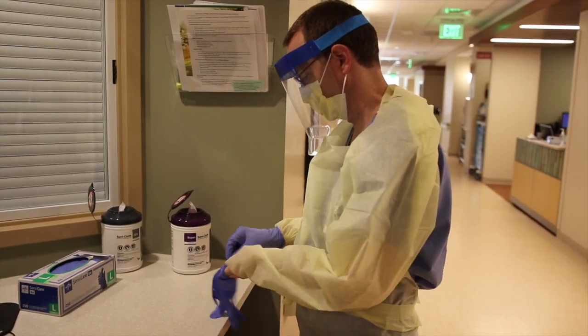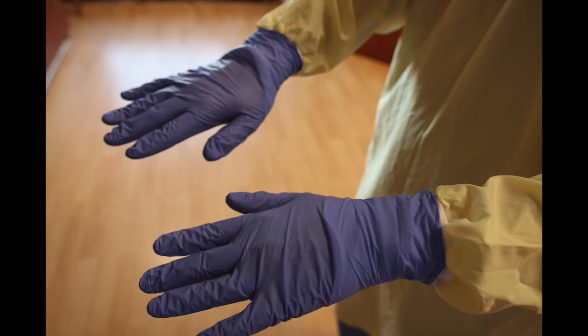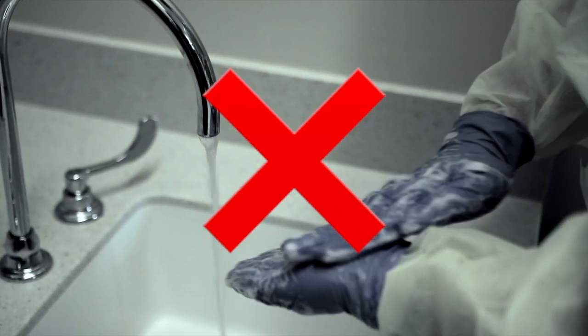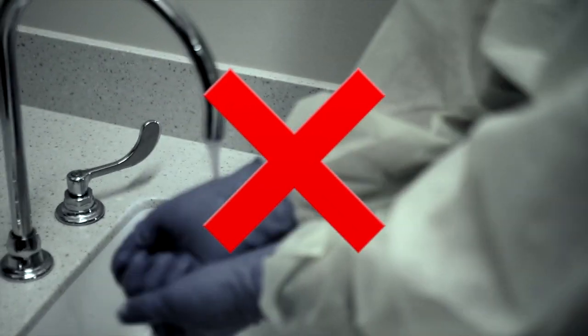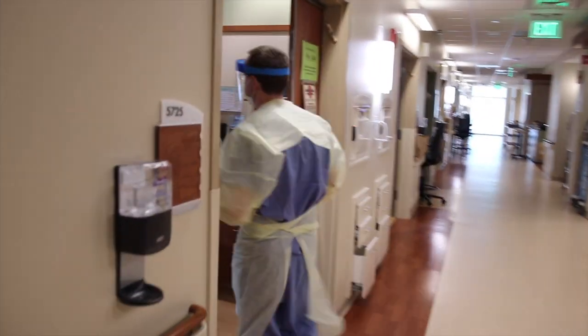If you are using a reusable gown, pull the elastic part of the gown forward, covering the base of your hand. Then pull the gloves over the top of the elastic part until they are covering it completely. Do not wash gloved hands any time when putting on or removing personal protective equipment. Washing gloved hands is an unnecessary step and can act to break down the glove itself. Once you are prepared, you can grab your equipment and then enter the patient room.